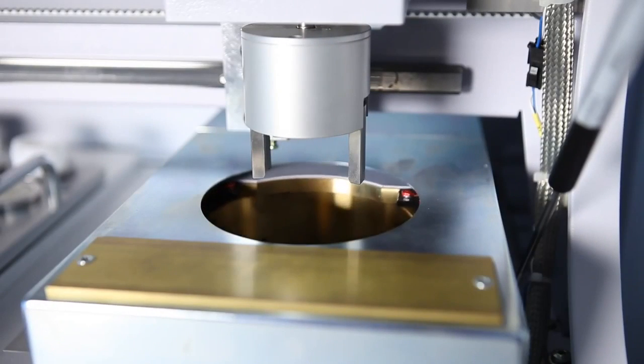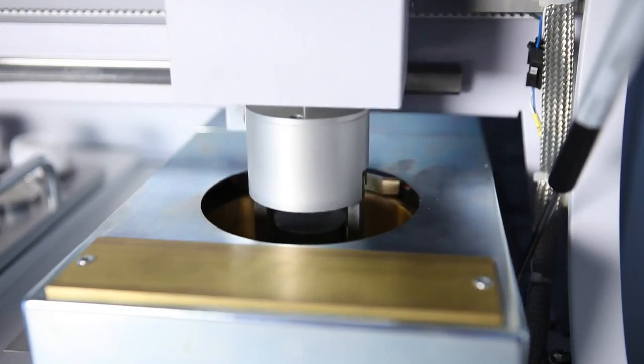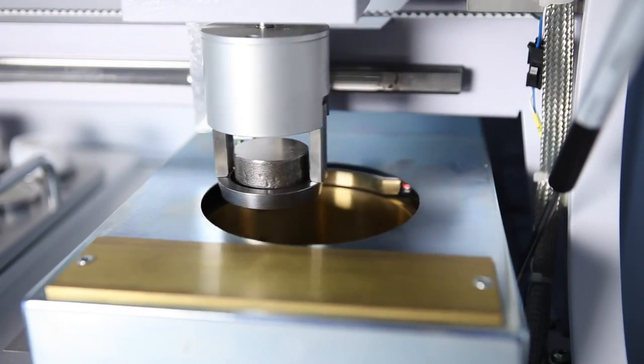Each sample that can be run in the Ranger can be different and have different parameters — from a liquid sample to be run under helium, to a pressed pellet to be run under vacuum. You have the option to change parameters for each sample that you're running. It makes my day go a lot faster and smoother. If I'm ready to start another application, I can put the samples in, press start, and walk away.